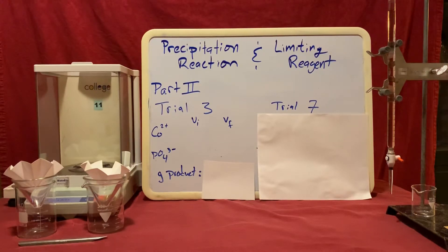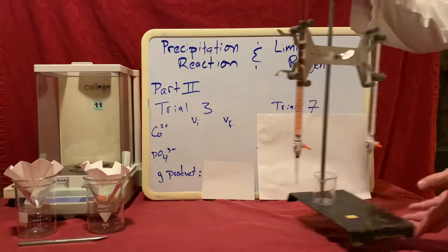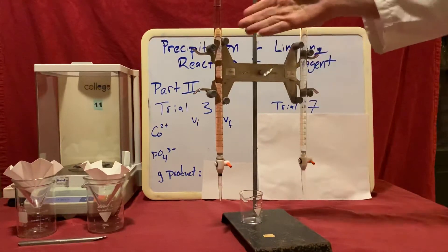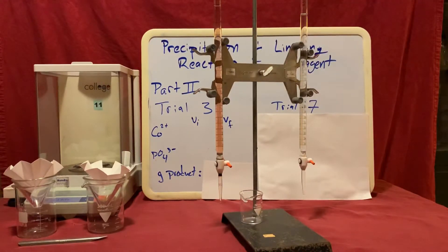Now before we begin we need to set up two burets. In this buret I have placed cobalt-2 hexahydrate. In this buret I have a solution of sodium phosphate. Both solutions in this example are 0.100 molar in concentration.